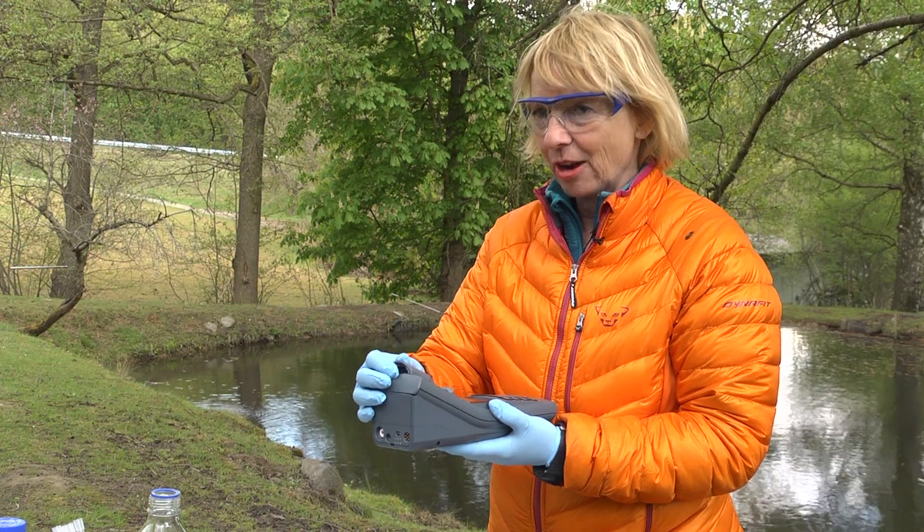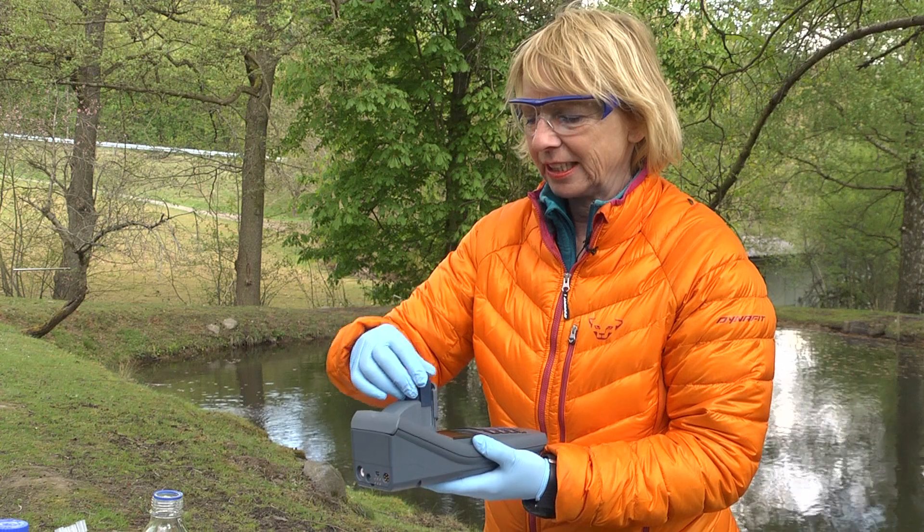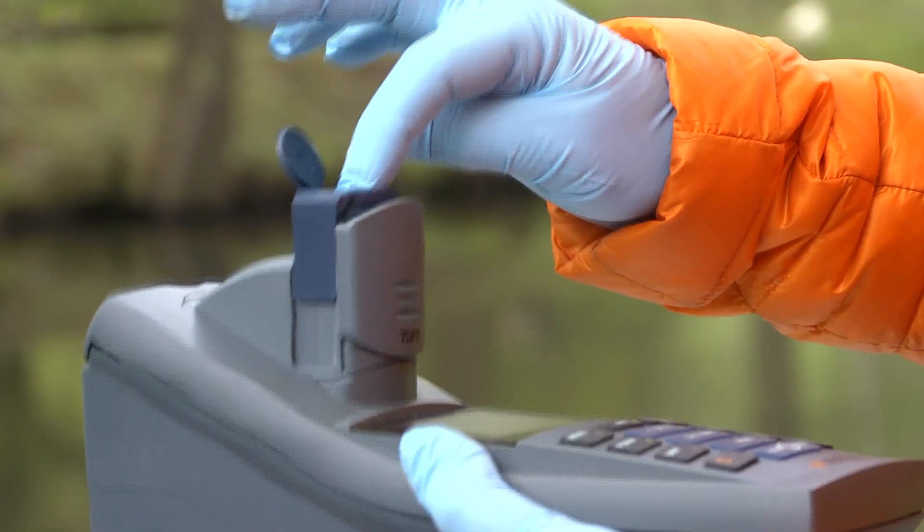It is also possible to use 16 mm cuvettes with this colorimeter. Simply switch the adapter position, put in the cuvette and start the measurement.